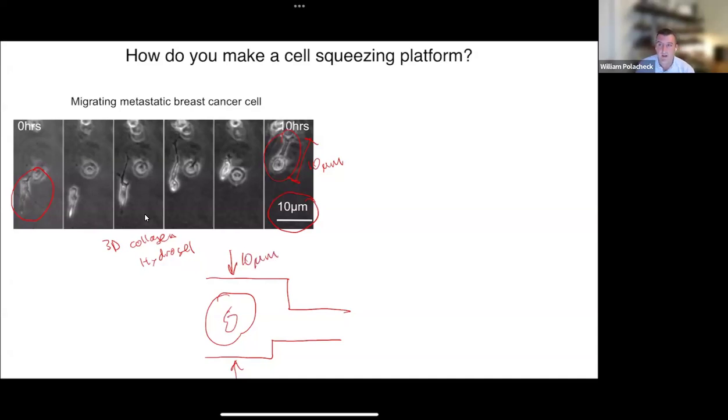That's very small. So creating a device that then allows us to squeeze further, let's say make this something on the order of 5 microns or maybe even less, this is quite challenging to do, to pattern physical structures that are on this length scale.